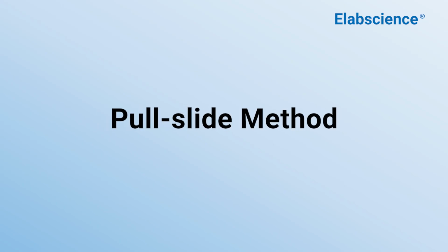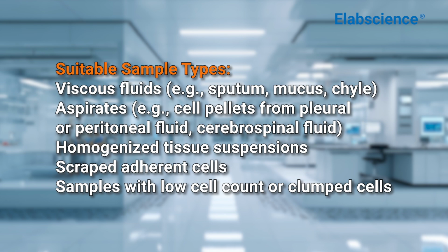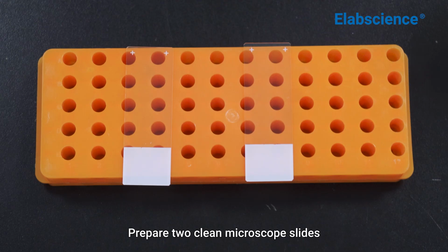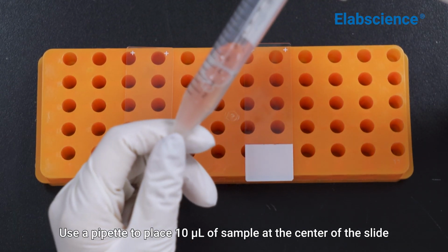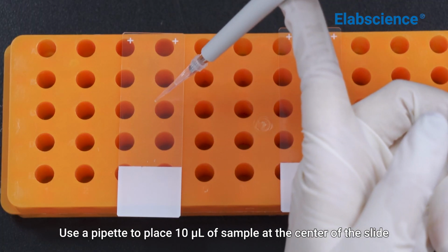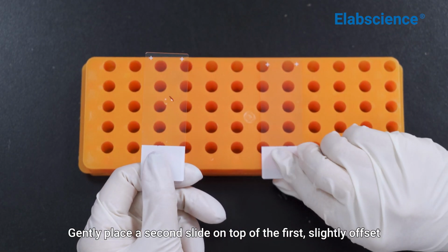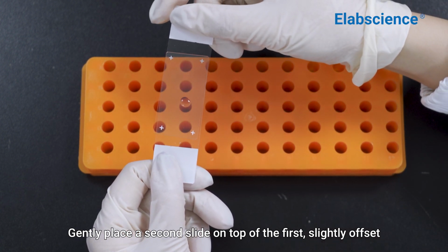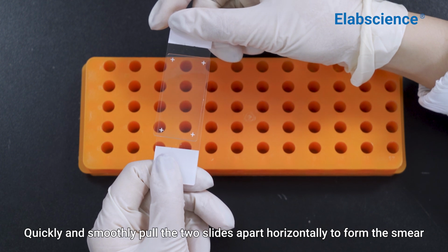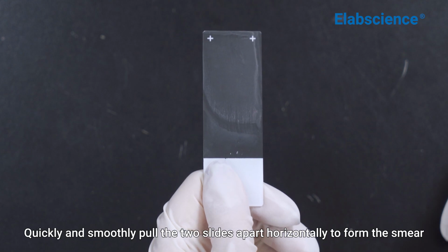Pull slide method. Prepare 2 clean microscope slides. Use a pipette to place 10 microliters of sample at the center of one slide. Gently place a second slide on top of the first, slightly offset. Quickly and smoothly pull the 2 slides apart horizontally to form the smear.